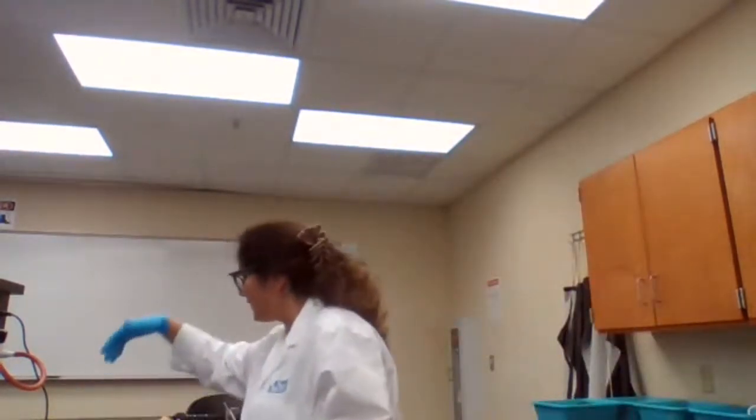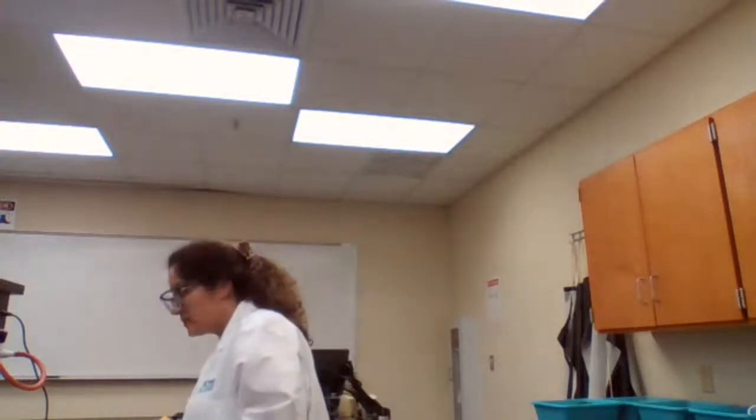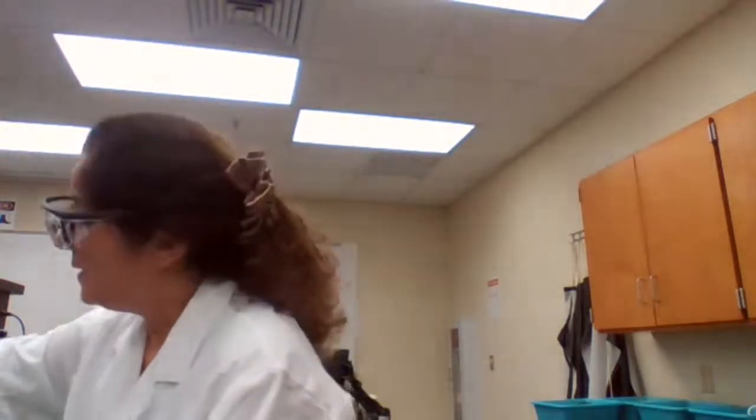So, finding gloves, because we are using silver nitrate. First, we're going to place 2 milliliters of silver nitrate in a test tube and add some sodium thiosulfate to the silver nitrate and look for evidence of the reaction. So I'm going to show you what's happening here.